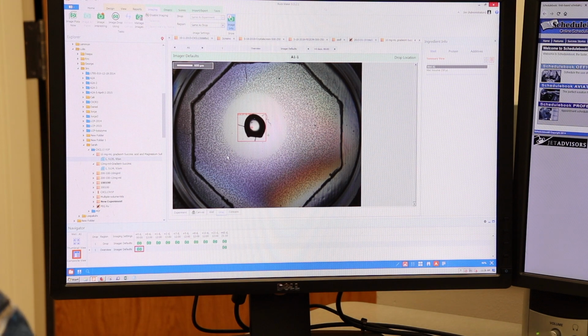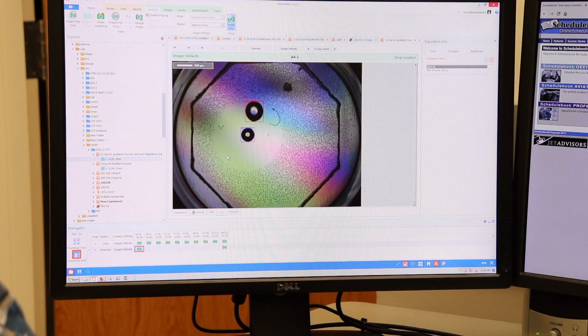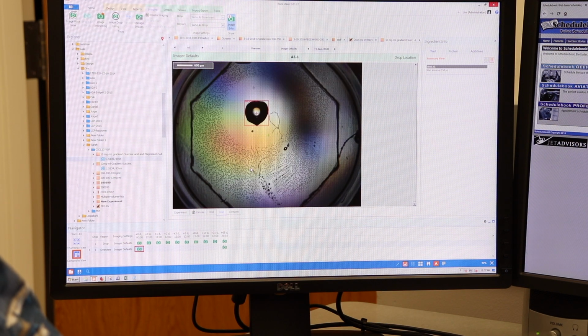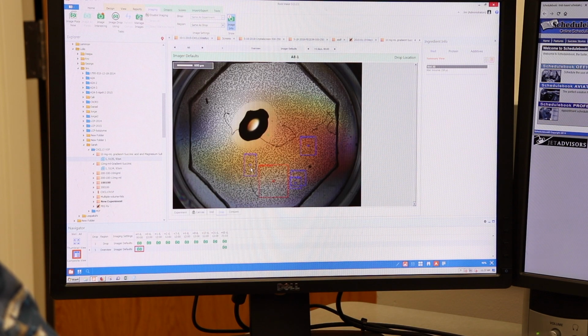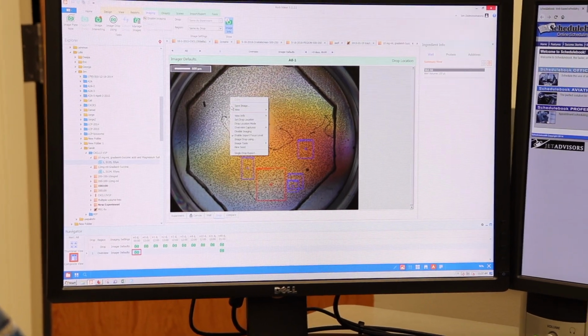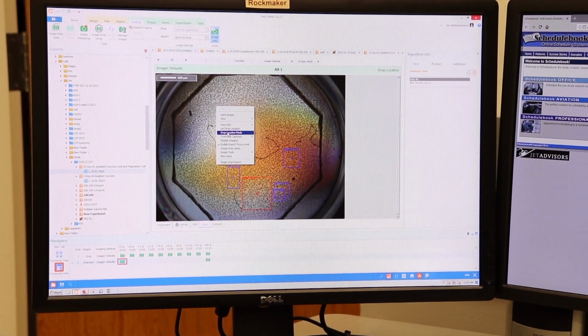Normally what you do is just use the right arrow, go through the plate, manually inspect them. If it draws a blue box, that's a possible second drop or another interesting spot to image. So go along. It's usually pretty good. Occasionally it'll make a mistake. For example, here in well A8, it's decided that the drop is here for some reason, so basically it's just going to image noise.